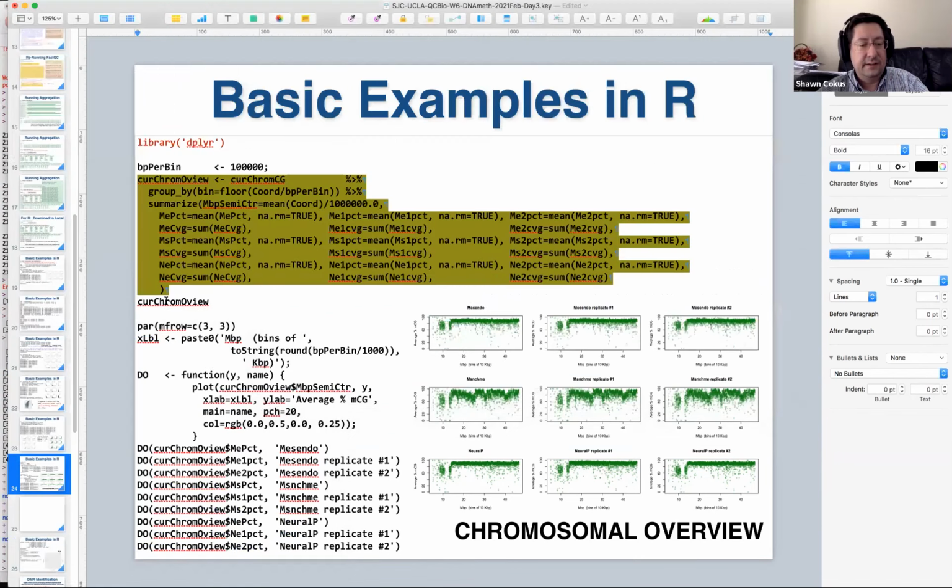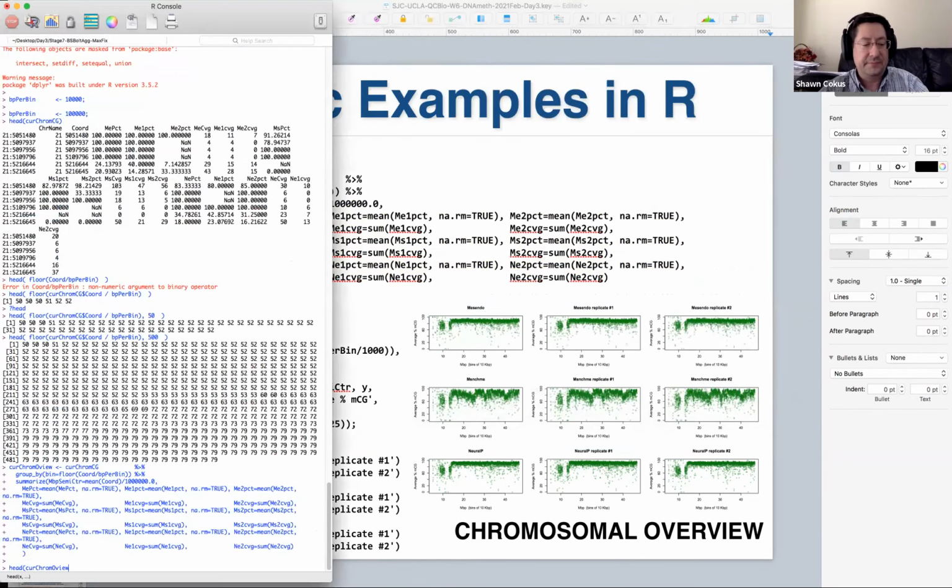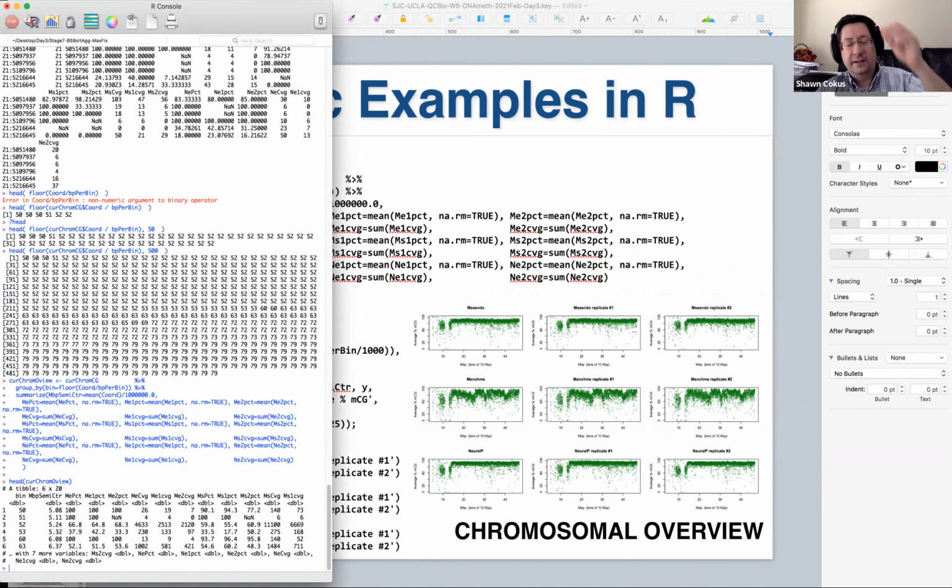And here is what that guy looks like. It's not a data table anymore, now it's a tibble. That is the kind of silly, lighthearted capriciousness that is the tidyverse. It's not a table anymore, it's a tibble. Okay. It is a 6x20 tibble.